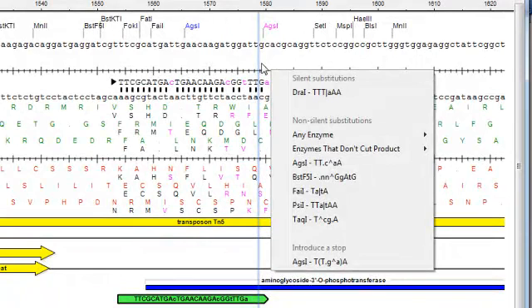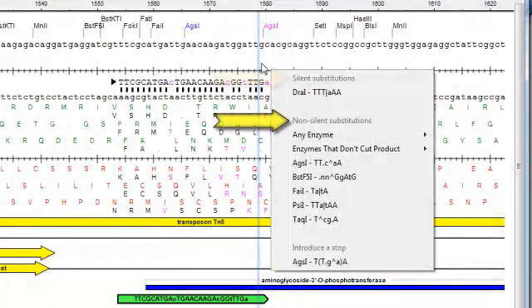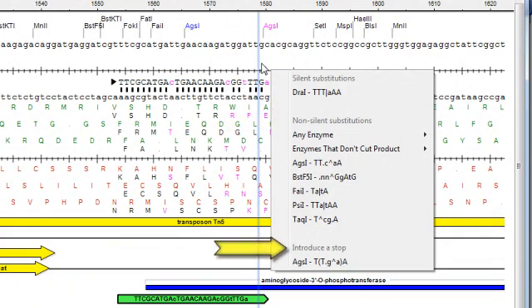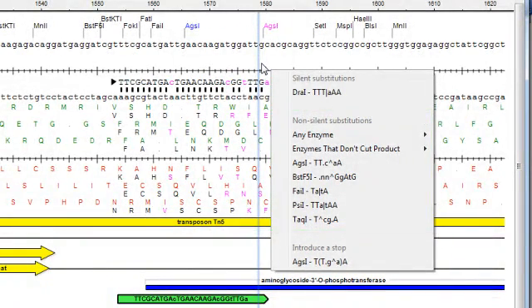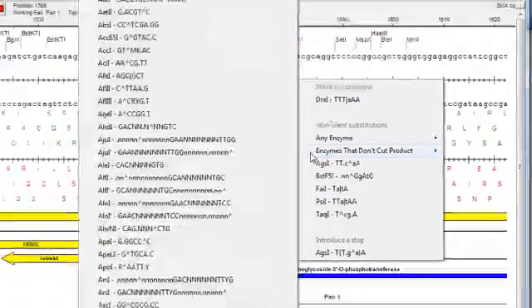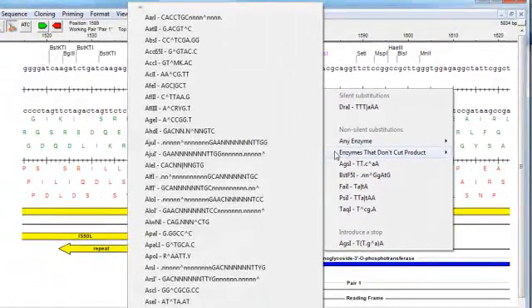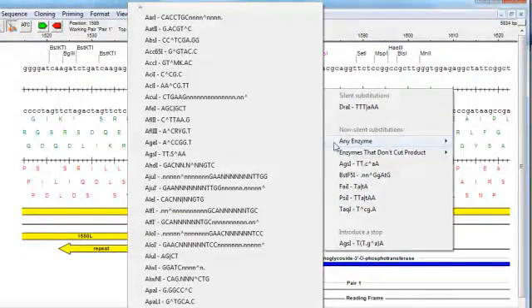You'll notice that the enzymes are organized into three groups based on whether they are silent or non-silent substitutions or if they introduce a stop. In the non-silent group, you'll see a couple of additional lists, one for enzymes that don't cut the product and another for any enzyme.